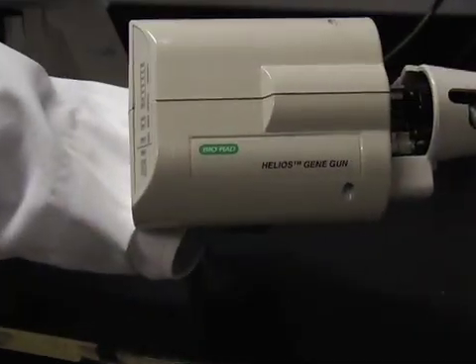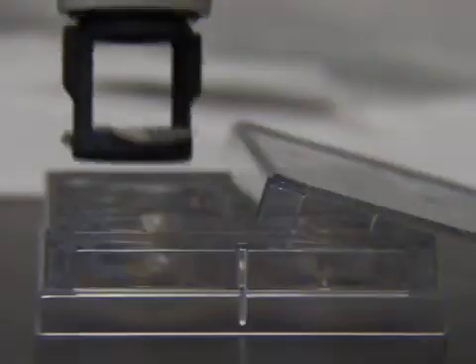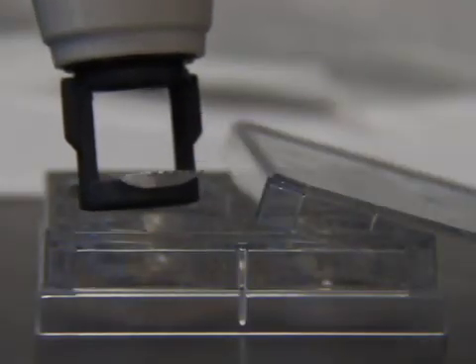Biolistic or gene gun transfection is a physical means of transfecting cells by bombarding tissue with high velocity DNA coated particles. This technique is an efficient and easy means of transfecting neurons and is especially useful for transfecting only a small number of cells in tissue slice.